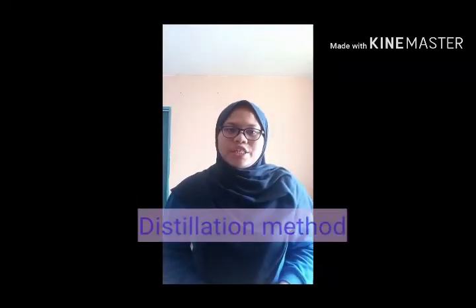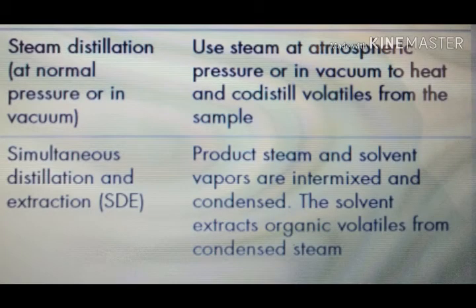Next is the distillation method. The specific methods are two. First, steam distillation, and then simultaneous distillation and extraction. Steam distillation uses steam at atmospheric pressure or in a vacuum to heat and co-distill volatiles from the sample. While in simultaneous distillation and extraction, product steam and solvent vapor are intermixed and condensed, so the solvent extracts organic volatiles from the condensed steam.